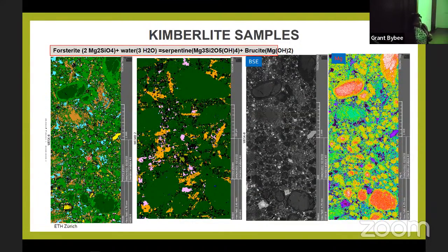And this was scanned at 1 micron per pixel. So that also played a huge part. It was done in high resolution. And you can see the pretty phase map is magnesium. You can see there's opaque zoning in magnesium here. The olivine is zoned, and you can see around this serpentine, but even the olivine still shows some zoning.